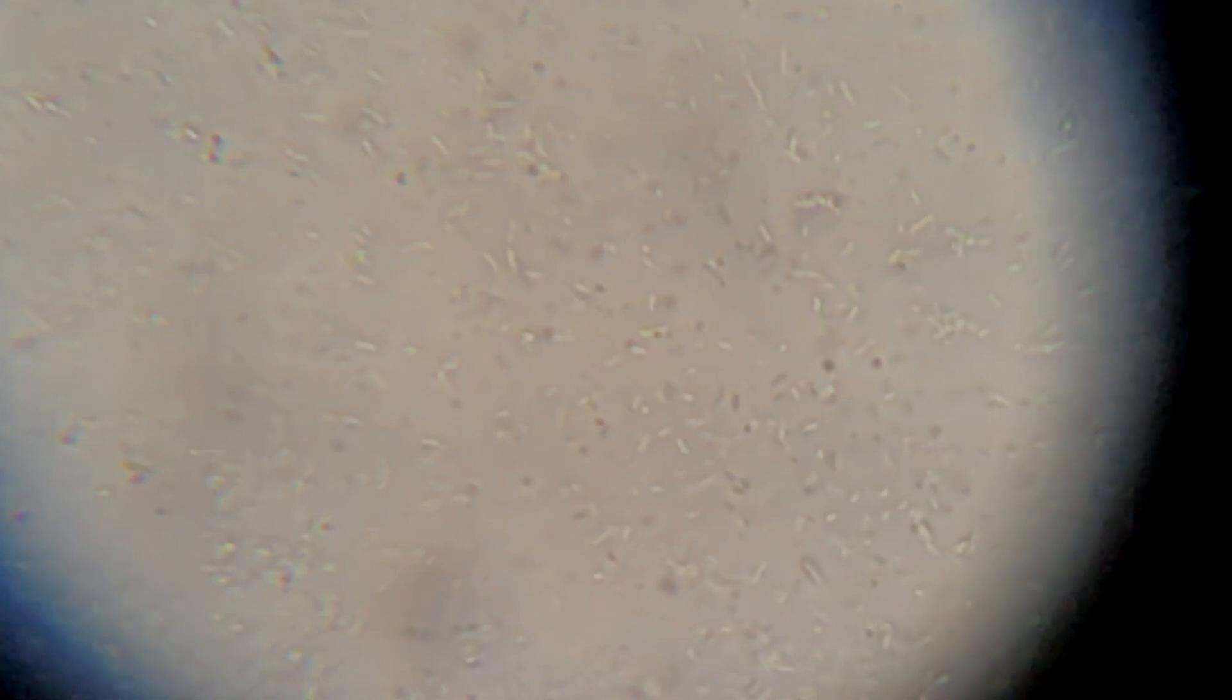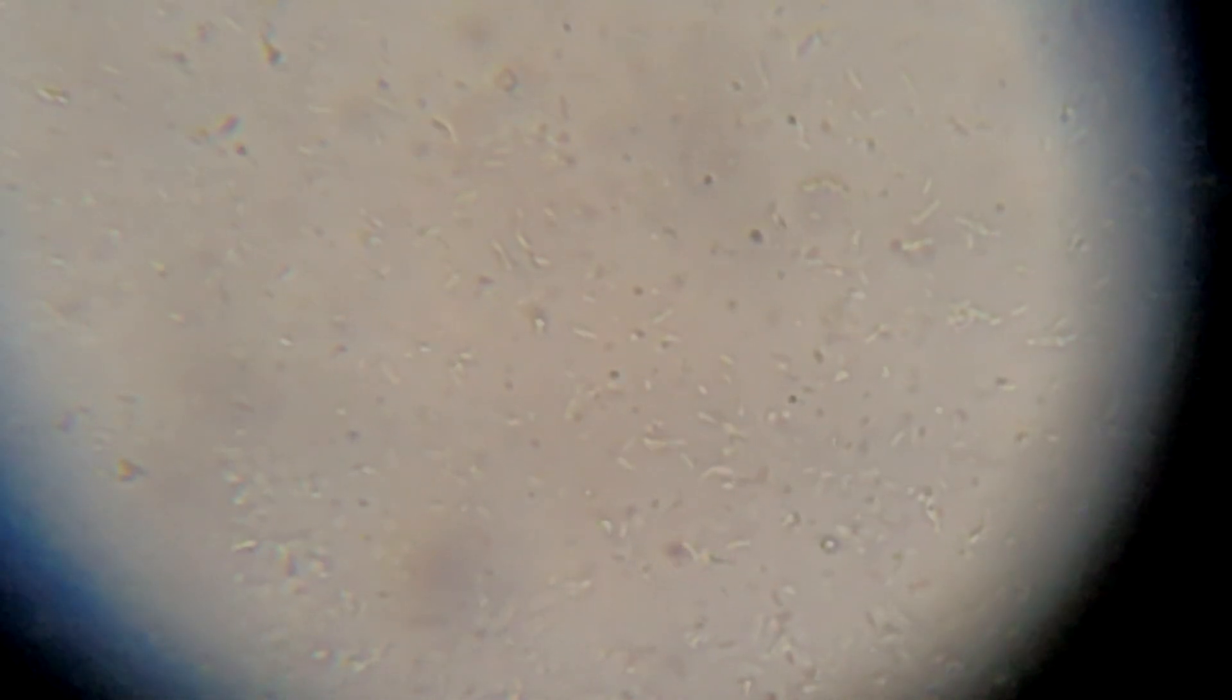You can observe this bacteria, Escherichia coli, is normally present in the gut of people and animals. Most of them are harmless and play an essential role in keeping the digestive system healthy, also helping to digest food and produce vitamin K.